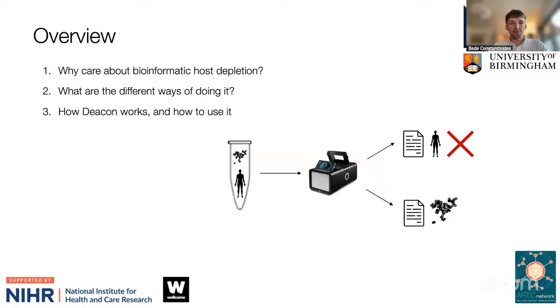So today I'm going to talk about three things really: why we do host depletion, the different ways we can do it and the approach I've developed, and briefly how to use it.